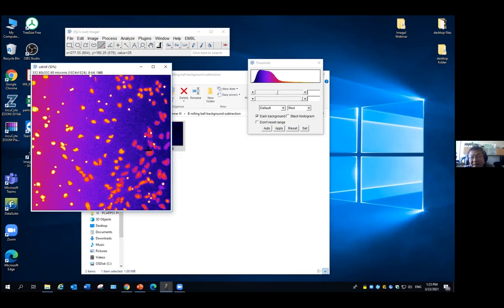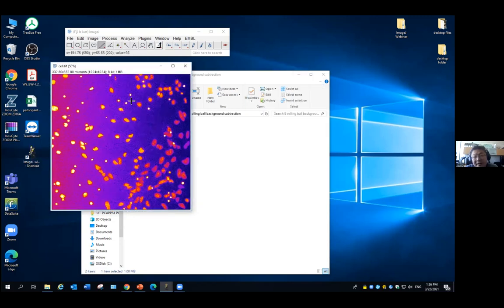So now let's say I already have the data, how can I correct it? In this case, we assume that the left side has a higher background value, so we want to compensate for this. There are two ways. Here we will use local background subtraction. Later, in the example on image calculators, we will use a reference image to correct it, which is a better way to deal with it. But here we use this as an example to show you local background subtraction. So our goal is to consider the left side as a higher background than the right side.